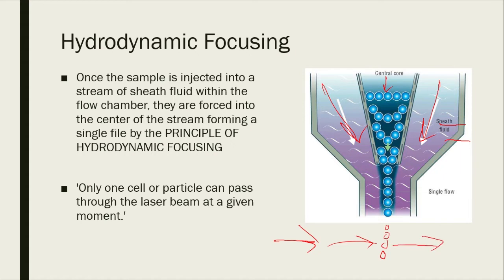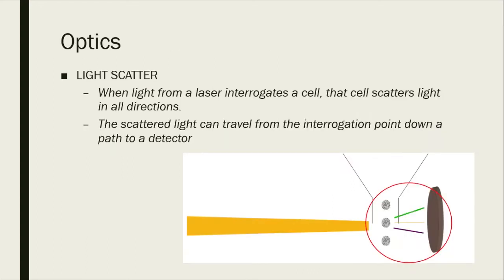Now this is older technology, where sheath fluid is used to generate a channel. A newer technology uses microfluidic channels. Basically, it is a very, very narrow straw where only one cell can pass through. It can also serve the same process. These machines are smaller and a little bit cheaper, because you don't need to generate a force of liquid inside the machine. So technology is constantly evolving.